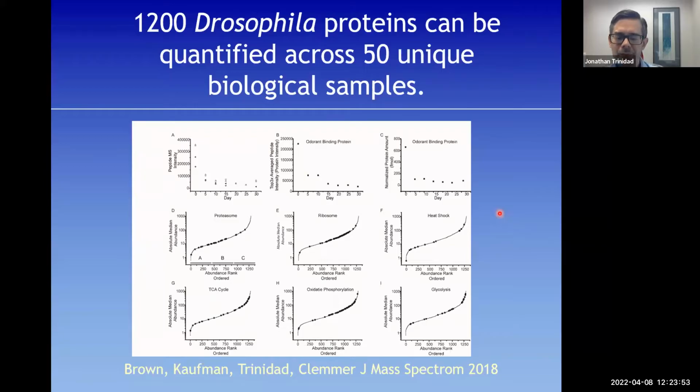We have ion mobility in the lab as well, in the form of a Synapt G2-S, which is an instrument from Waters Corporation. I don't want to get into the details too much, but this gives you further enhancement of label-free quantitation ability.